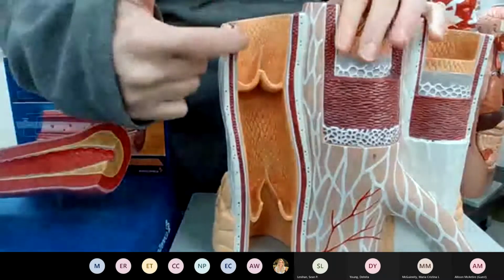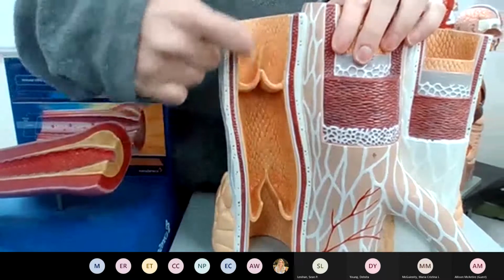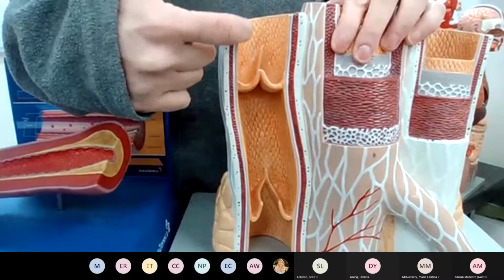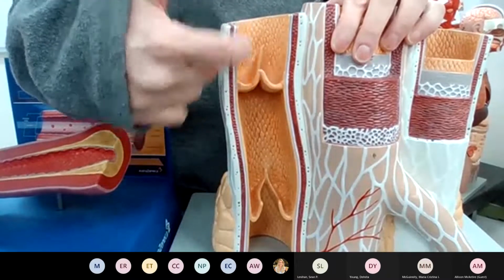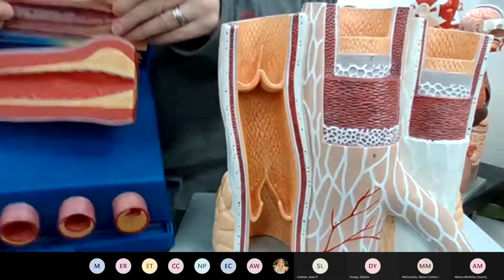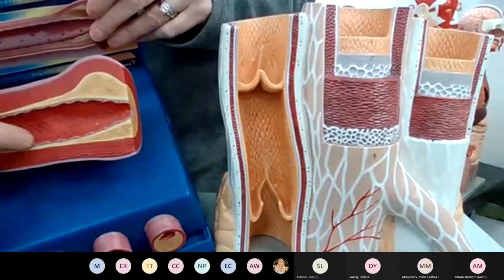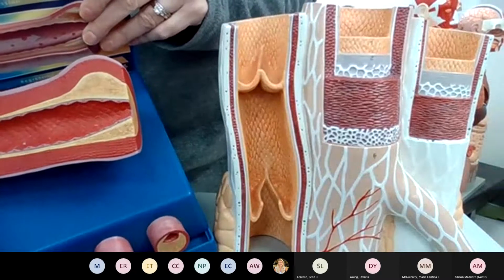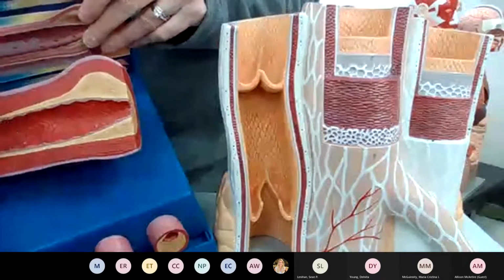So the tunica intima layer is the innermost, and its specific tissue is simple squamous epithelium. If you remember from the heart, those are known as endothelial cells. So they are flat and squashed, right? And you can see them here as these cells. Those are the simple squamous epithelium, also known as endothelial cells.